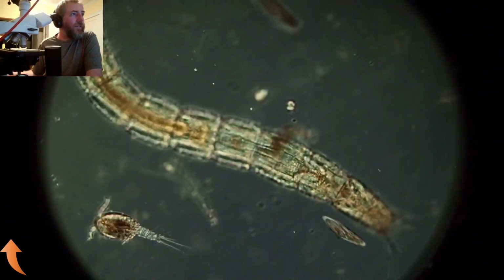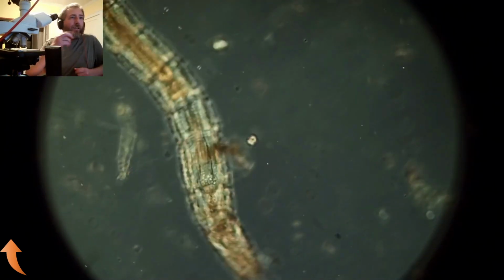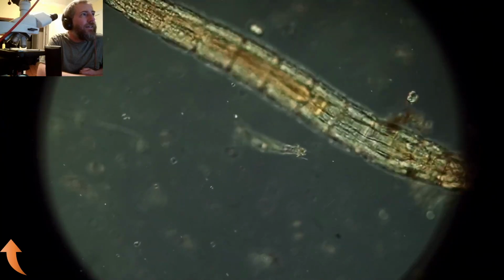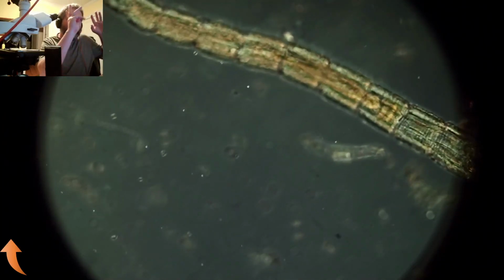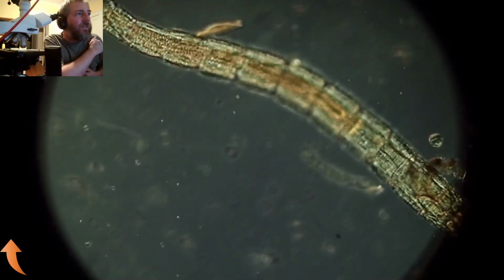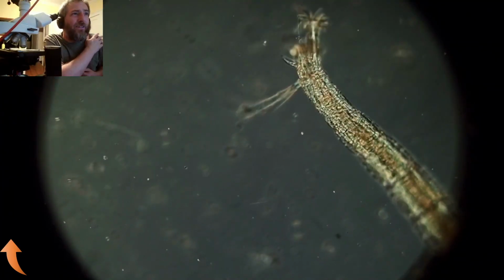If you're coming from the paleontology stream, the chitinous material on these things basically will fossilize in lake sediments. Yeah, so that's a chironomid. You probably know chironomids from the flying stage of their life cycle. They look like a mosquito, except they kind of have fuzzy antennas and they don't bite anything. They don't attack people. So I think they eat bugs or something, or maybe they don't eat at all in their adult life.